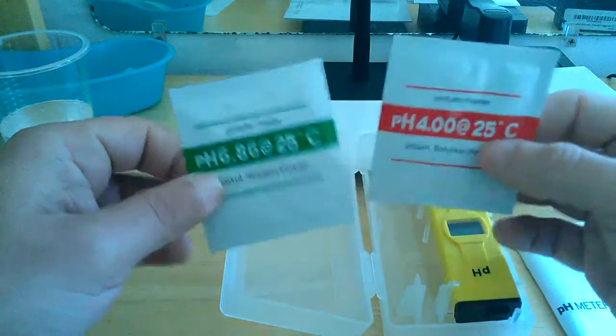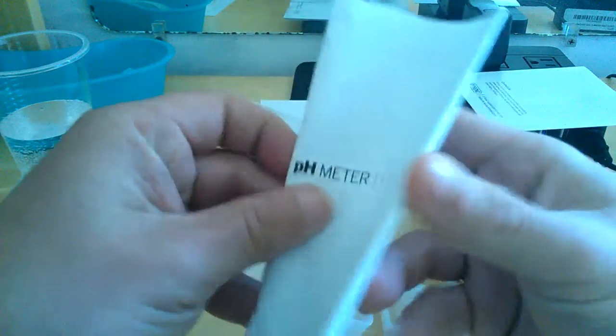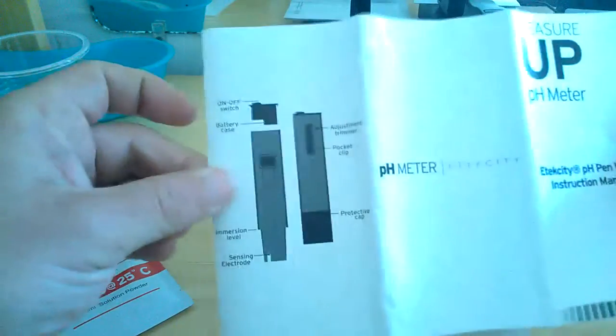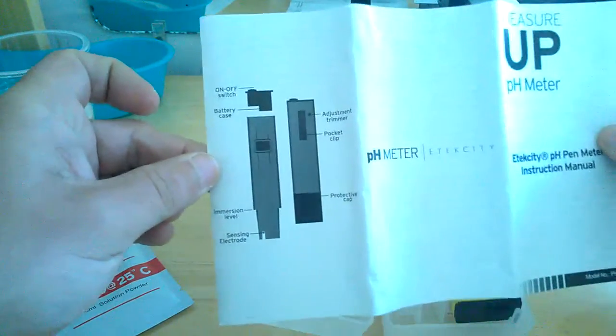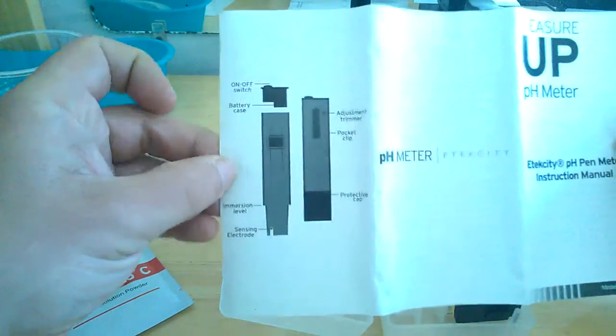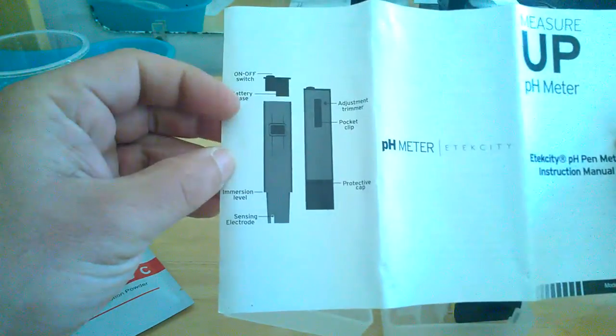There's two different ones here designed for different things. I haven't read up fully on that yet to fully understand all that stuff. But this here is the instruction manual that comes with it. Just simple design. On off on the top.